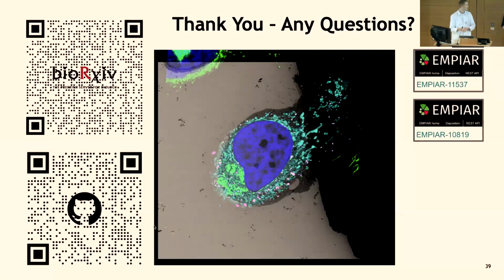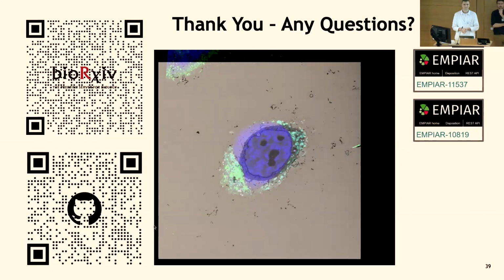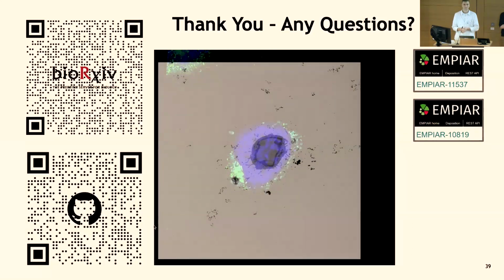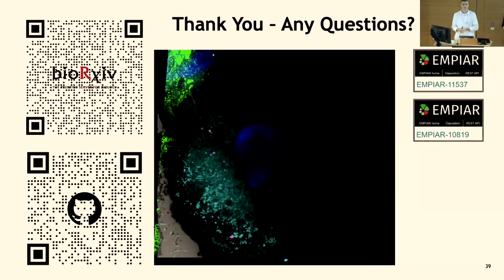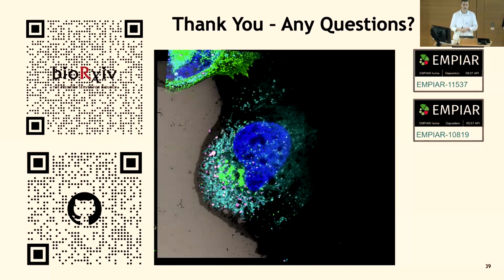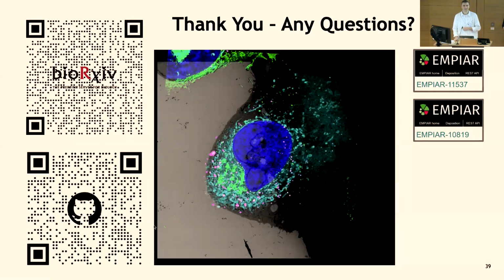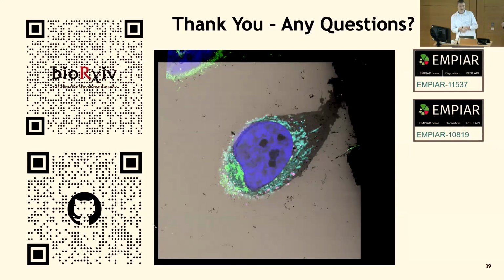Yeah, thank you. One more quick question before we move on. I was just wondering if you can comment on why you think the manual alignment still works better, and what areas it doesn't do well with? And whether increasing the Z resolution of your confocal images is going to make results better.